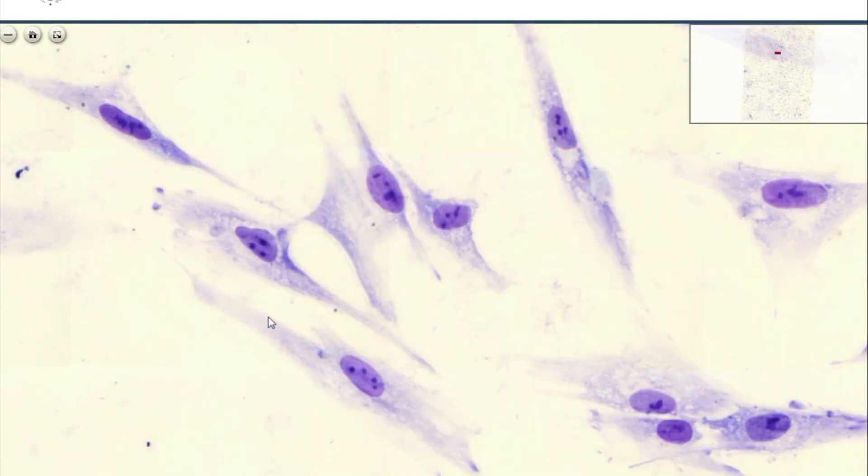With higher magnification, you can see even better the shapes of the cells. You also see that with this gentian violet, they stain from purple through blue to pinkish shadows. This depends on the physical and chemical characteristics of the cell constituents.